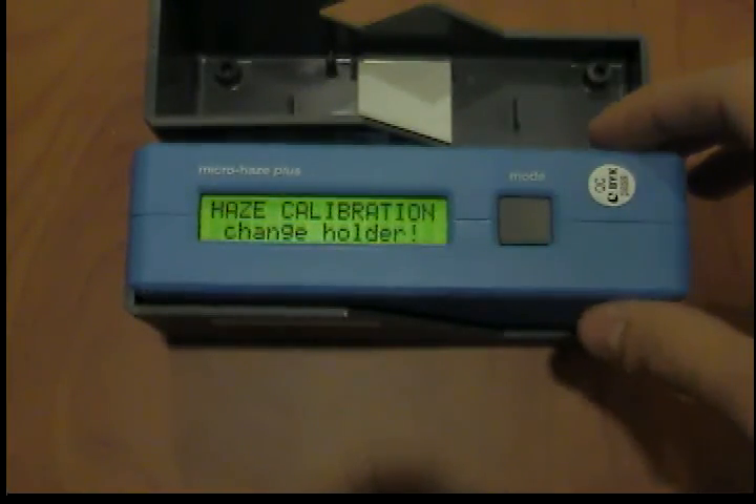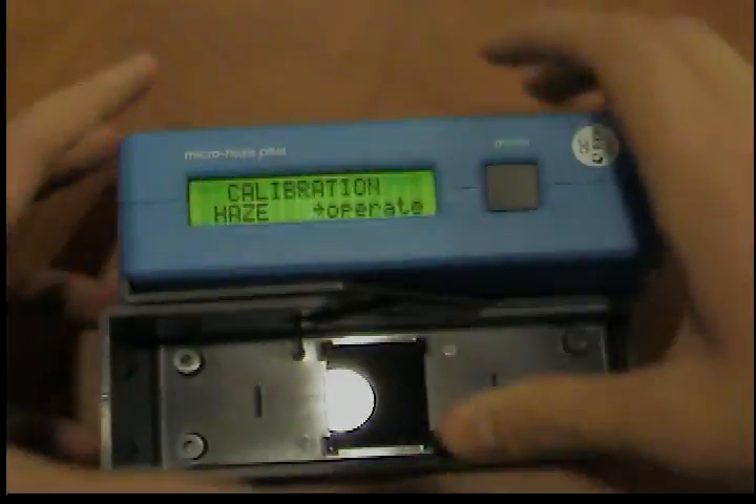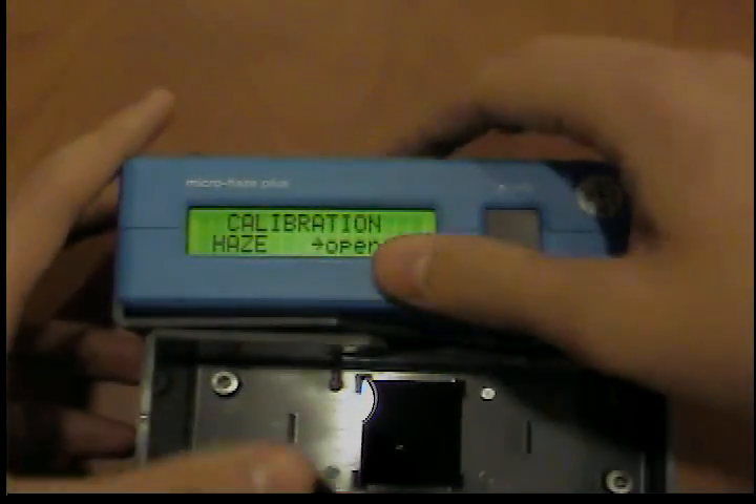To do so, remove the measuring unit from the gloss holder and insert it into the haze holder. Start the calibration by pressing the operate button.